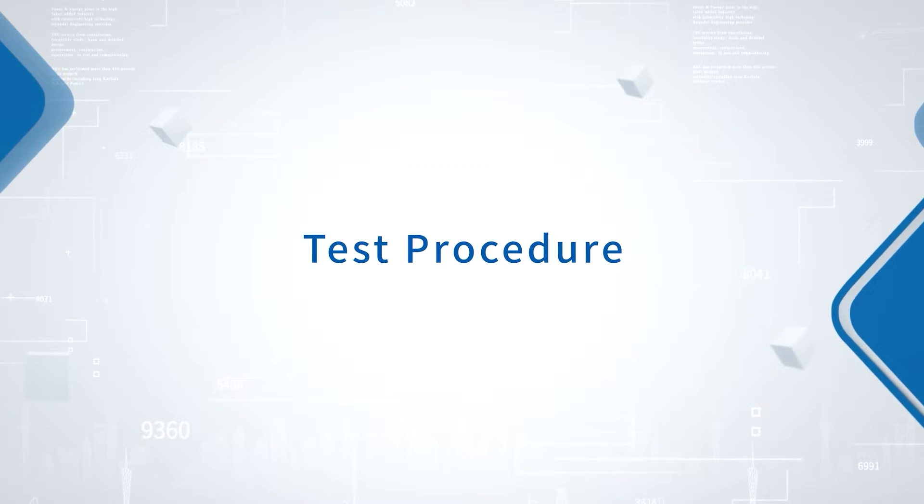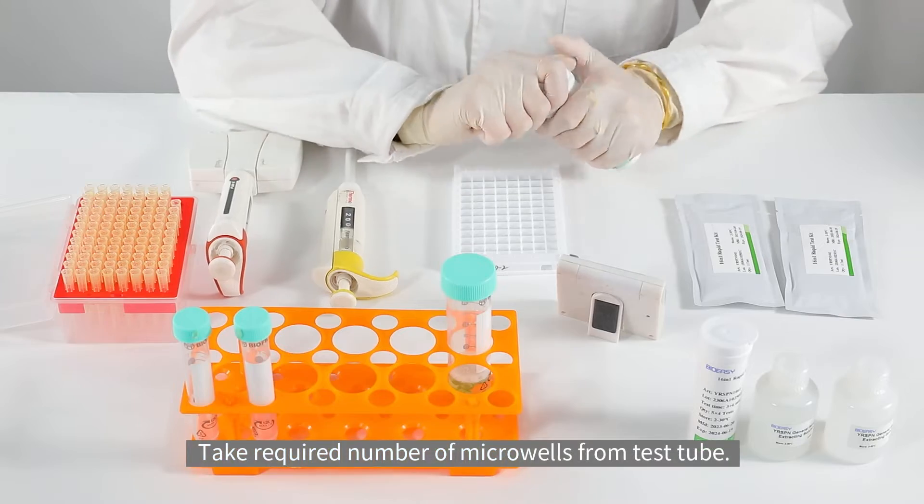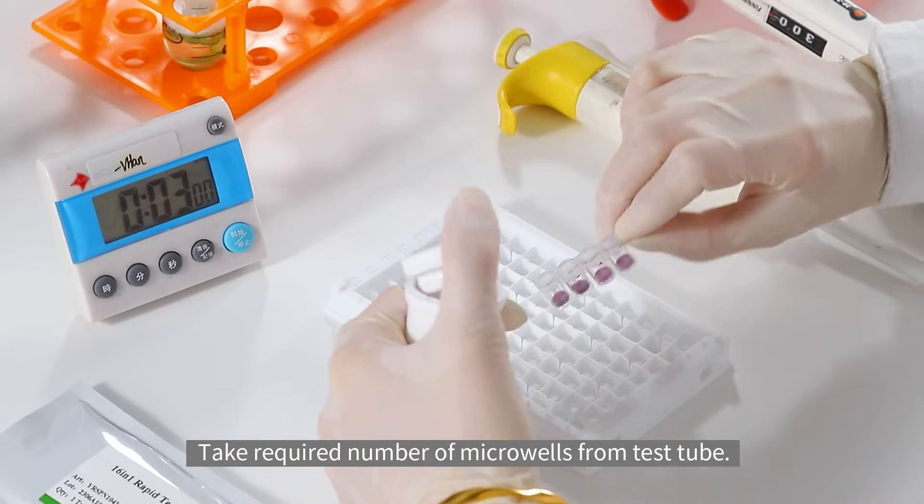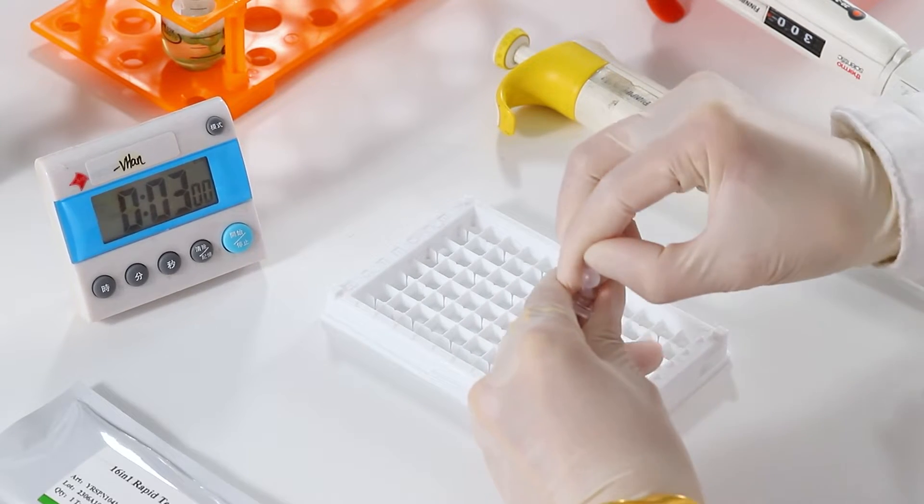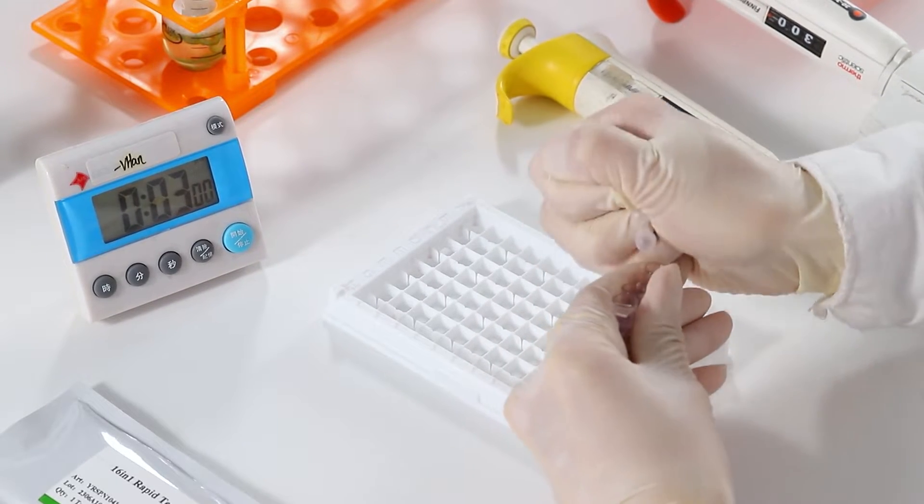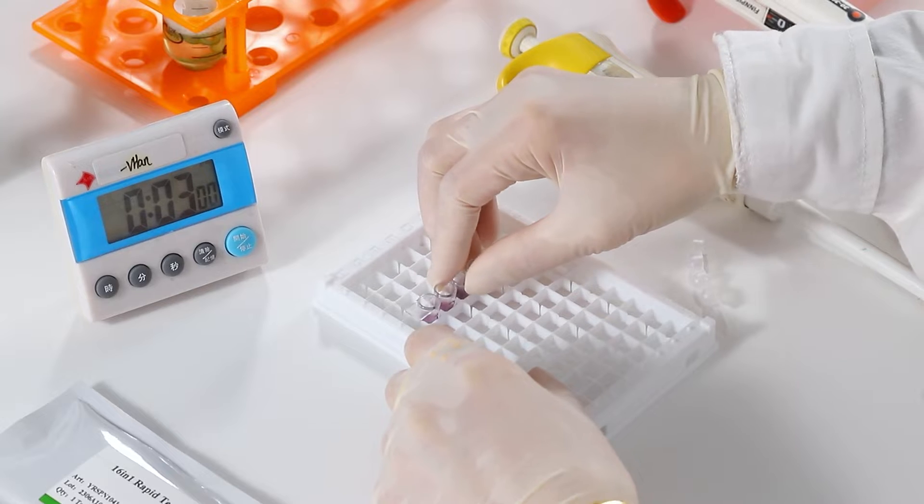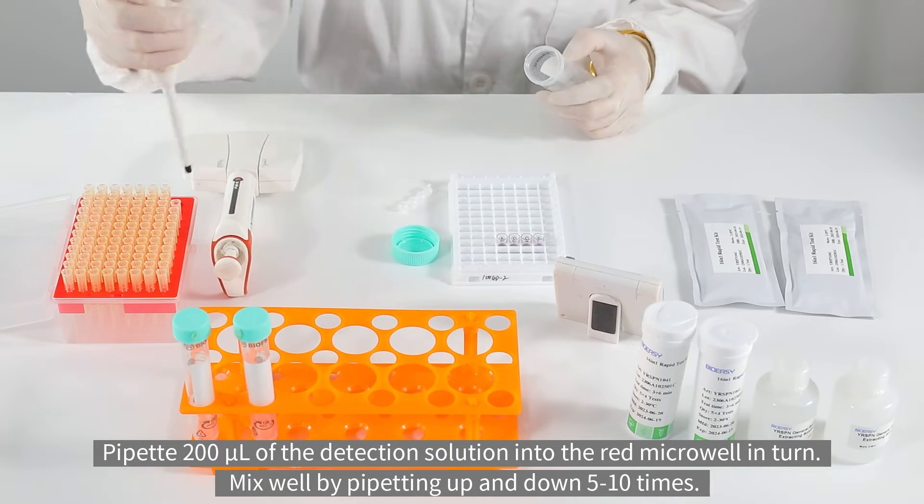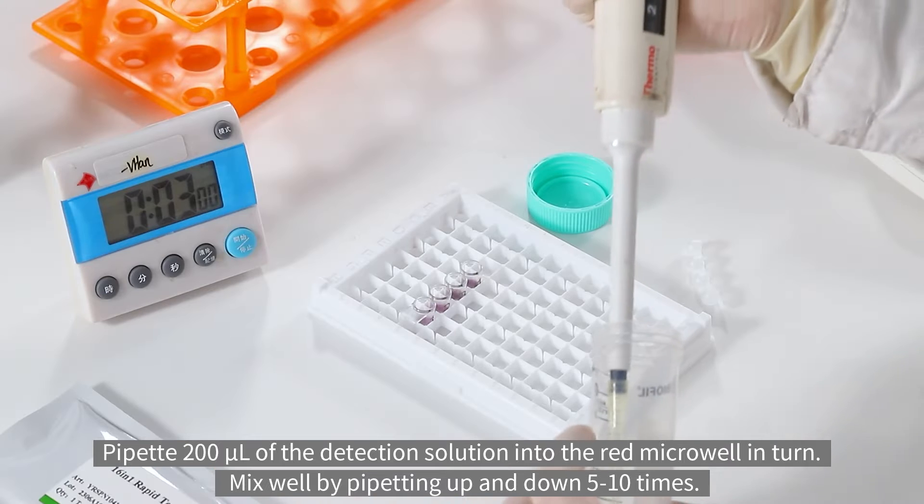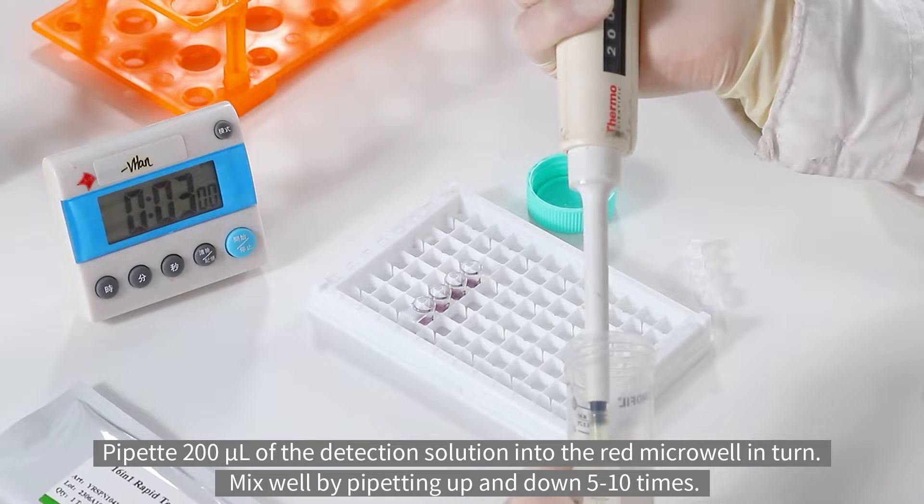Test Procedure. Take required number of microwells from test tube. Pipette 200μL of the detection solution into the red microwell in turn. Mix well by pipetting up and down 5-10 times.